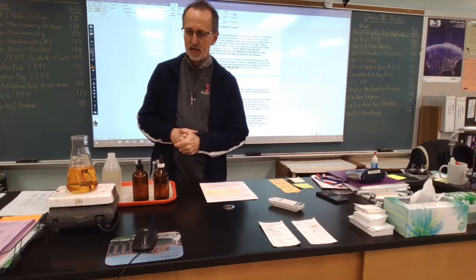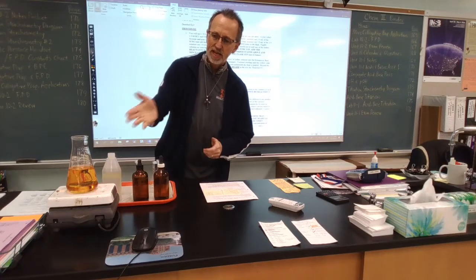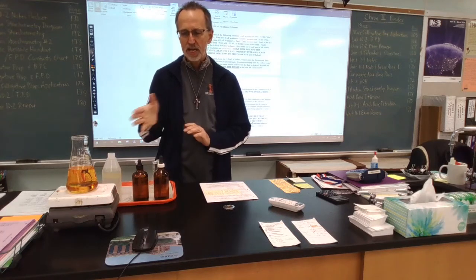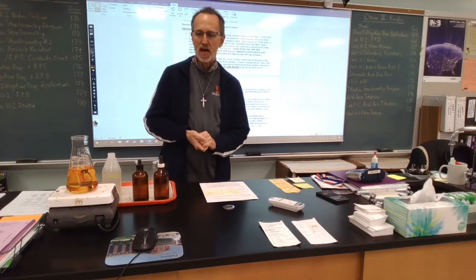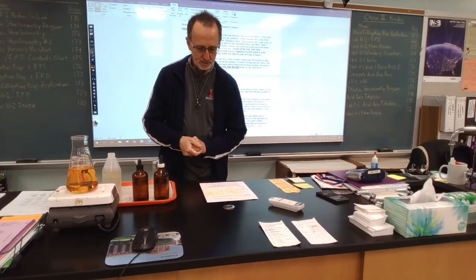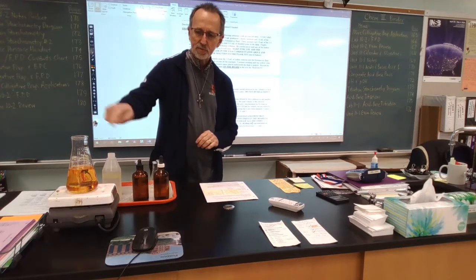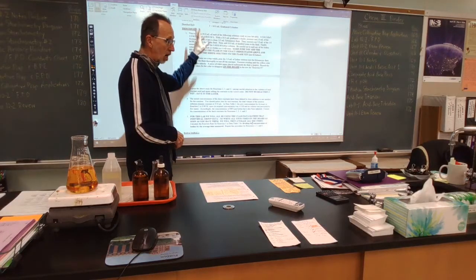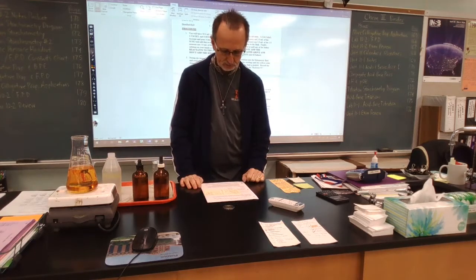And so it's been stirring now for over 5 hours, and it is now saturated. Like I said, these three here are our reactants, and then water is the volume equalizer. We'll talk about that here in a little bit.